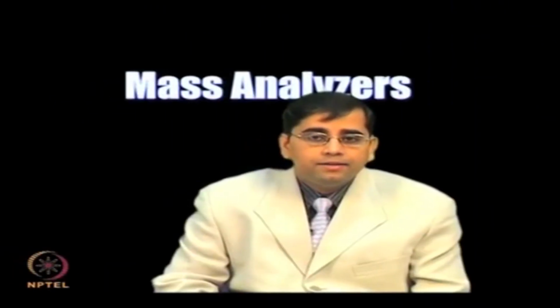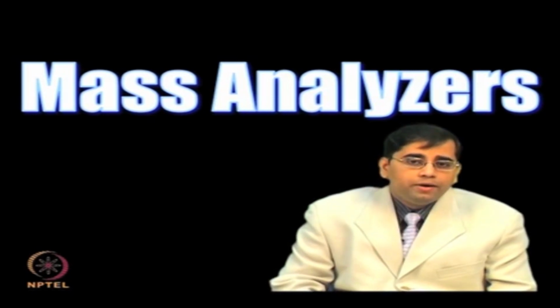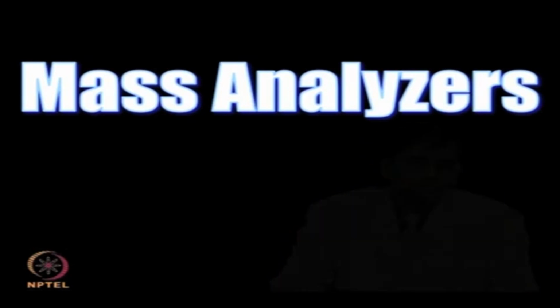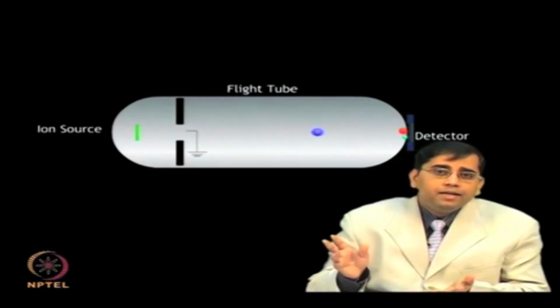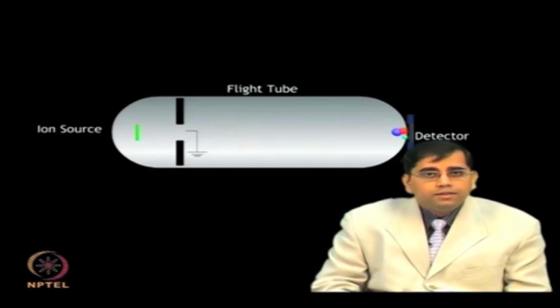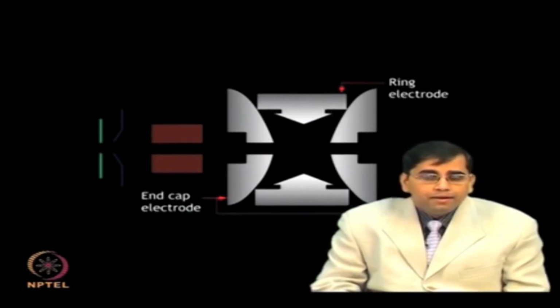The mass analyzer disperses all the ions based on their mass to charge ratio and focuses all the mass resolved ions at a single focal point and maximizes their transmission. The time of flight measures the m/z ratio of ions based on the time it takes for ions to fly in the analyzer and strike the detector. The ion trap traps ions using electrical fields and measures mass by selectively ejecting them to the detector.